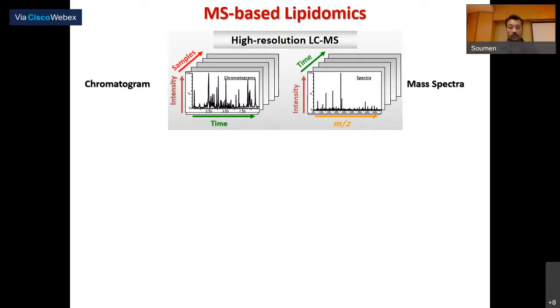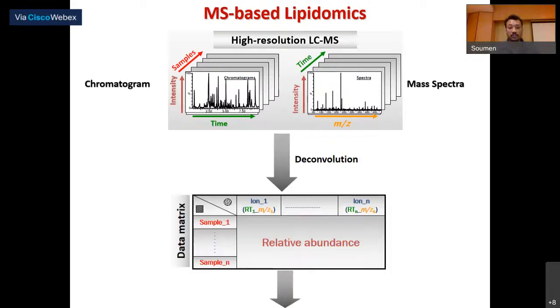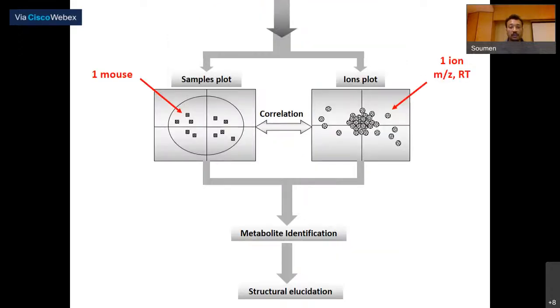This is very similar to what you see in omics, and then you will again do those analyses that we discussed yesterday. I won't go through them again. Similarly, you will identify features that correspond to the type or the sample group that you are interested in. And then, unlike metabolite identification, in this case you have lipid identification.